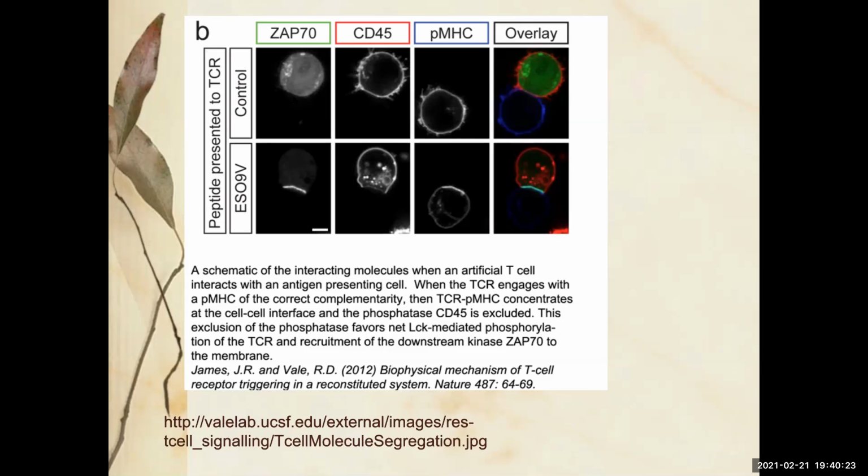In microscopy, when we say image, it can loosely mean just this overlay. It's also known as a composite. So you've overlaid 3 different images in this case. Sometimes you can add in a bright field image, like a DIC image, and that's 4. It's an overlay of 4 images. Or it can be an overlay of 2 images. Maybe you only had 2 channels, 2 colors. Whatever is appropriate for your image. The overlay is you overlaying several images, or making a composite of several images and turning it into one image.